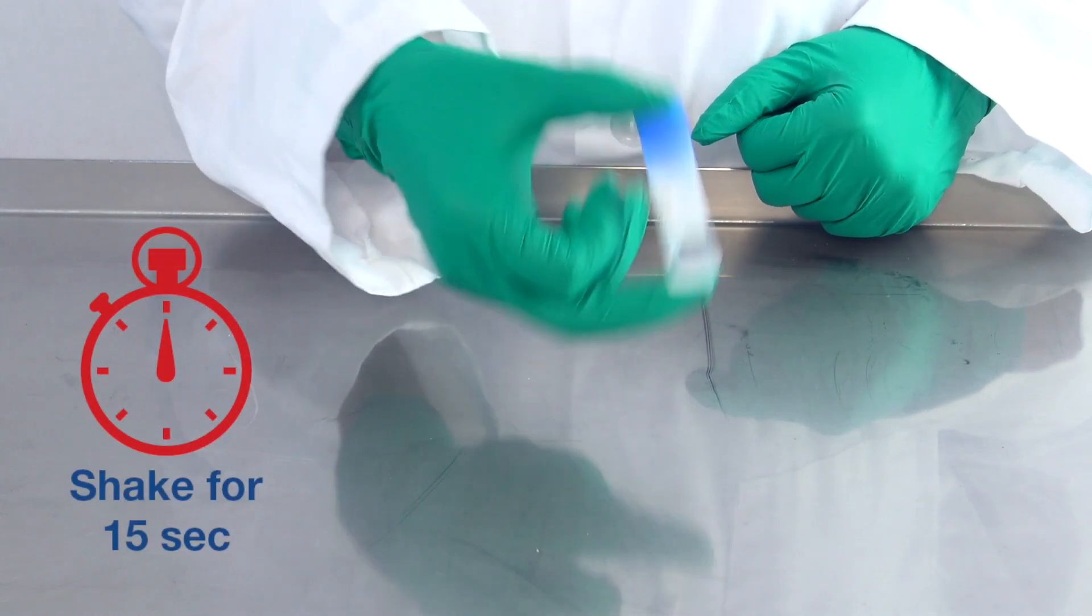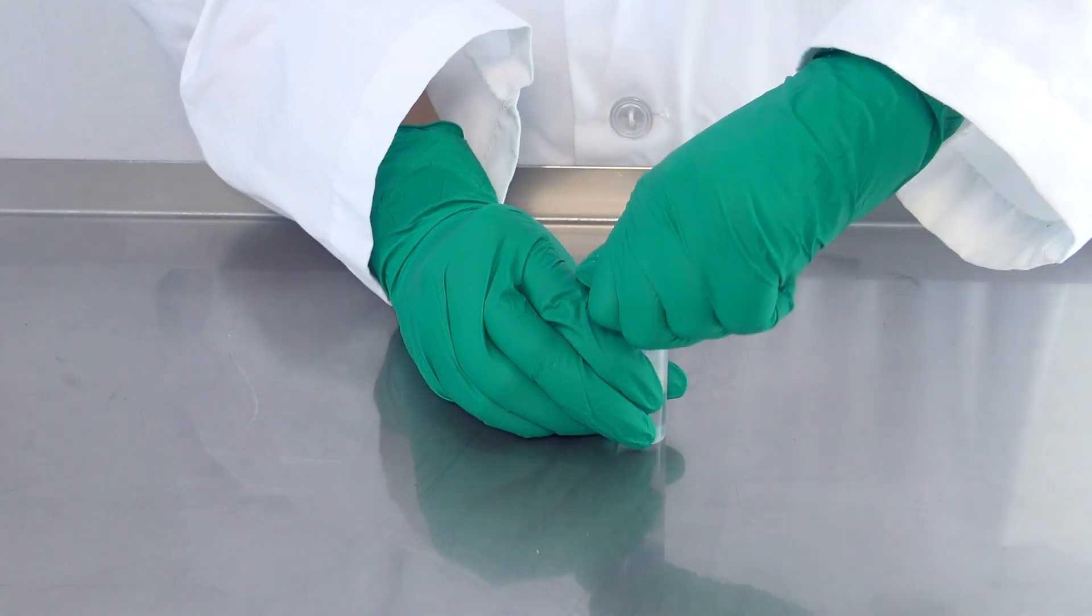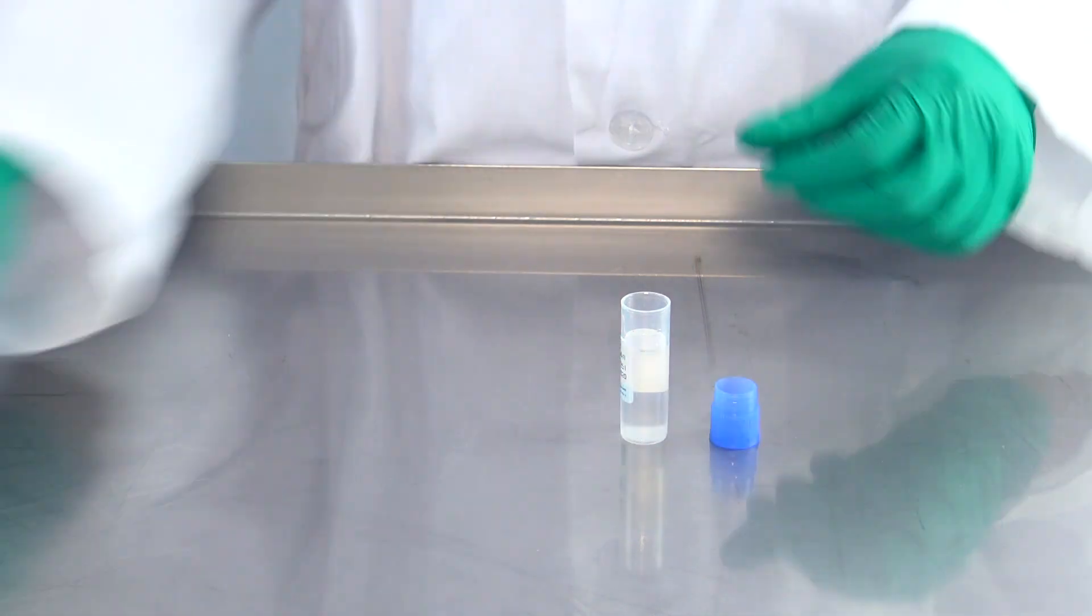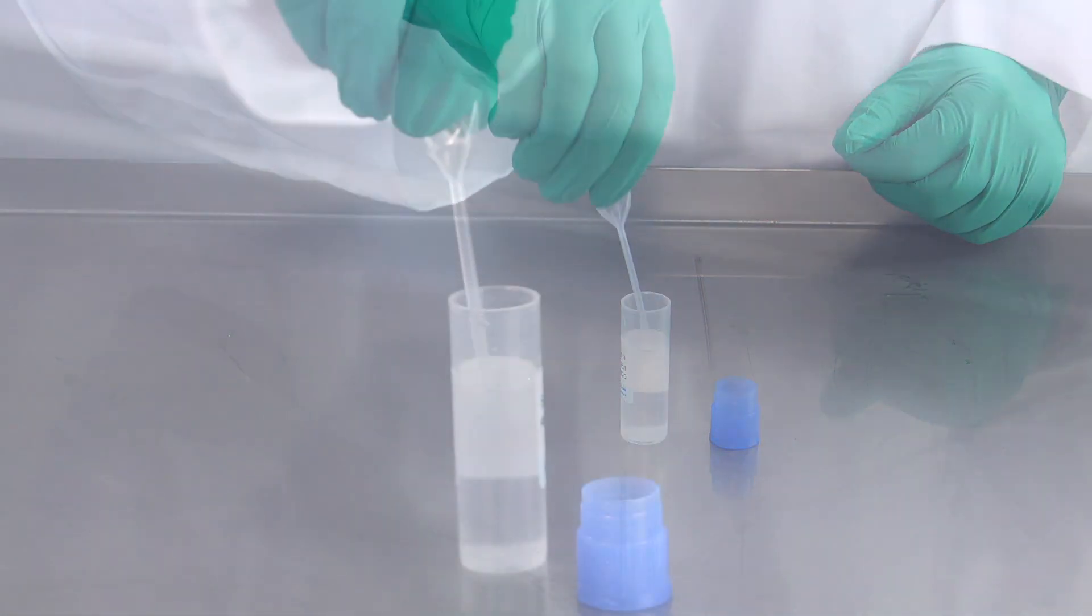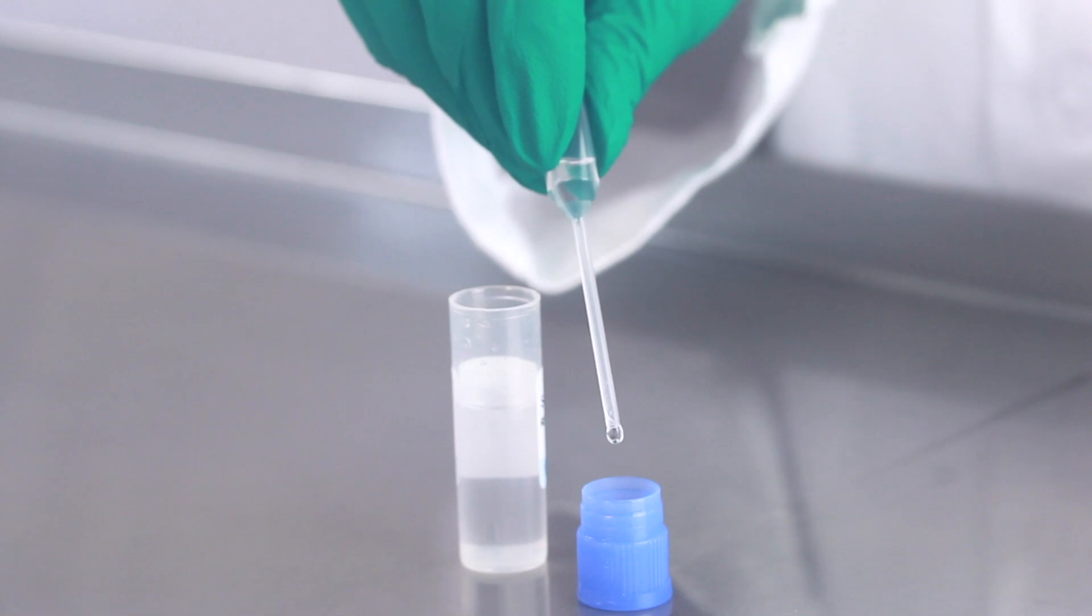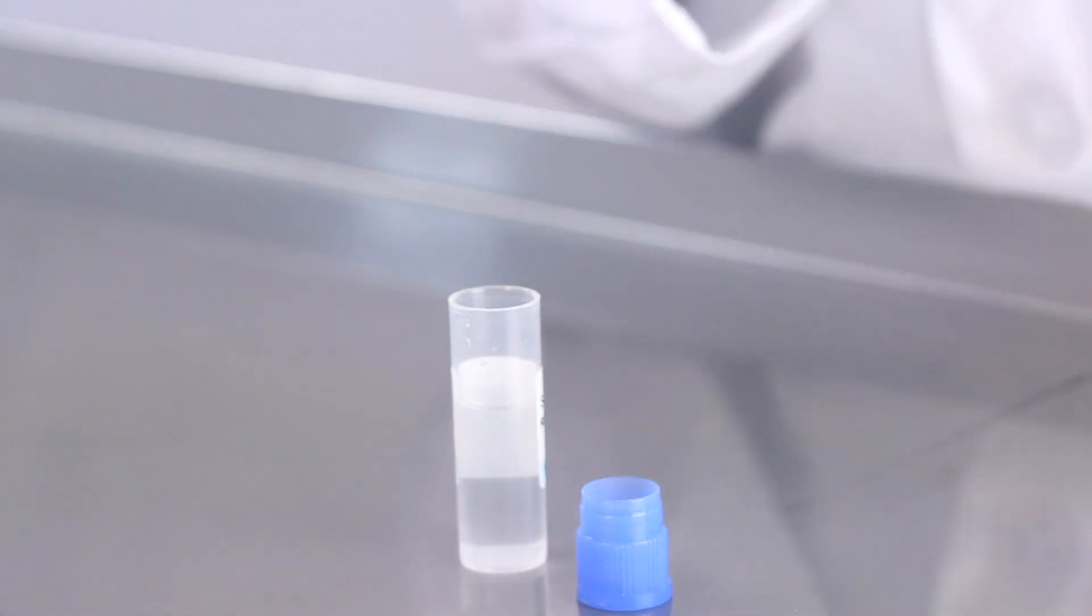Mix softly for 15 seconds, then open the dilution vial and place the blue cap upside down on a clean surface. Using a new disposable plastic pipette, add 10 drops from the dilution vial to the blue cap.